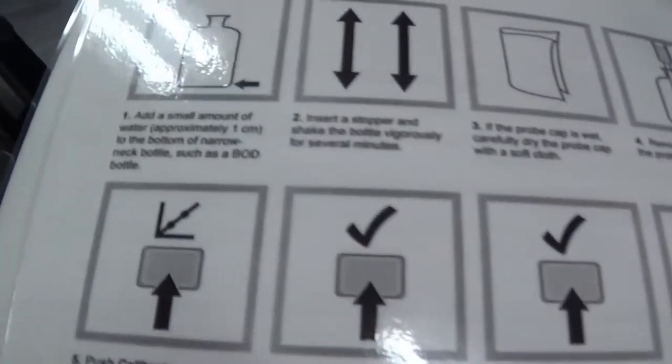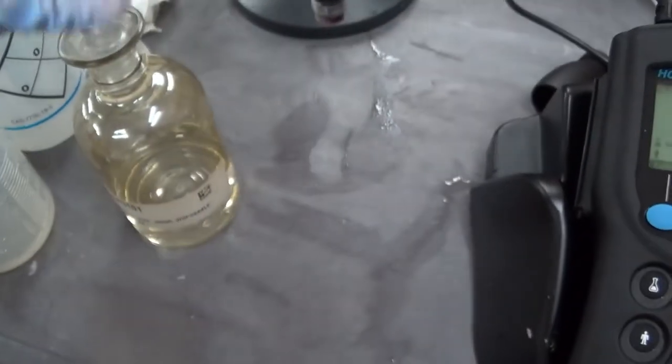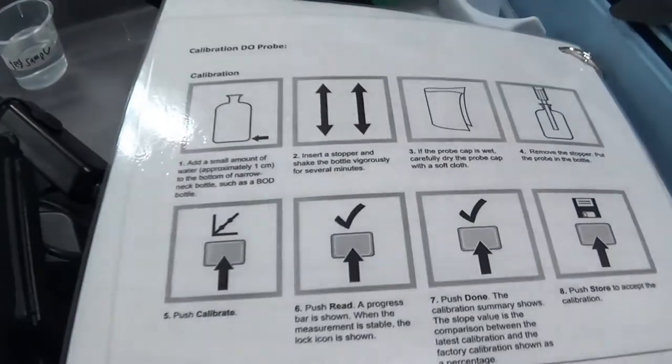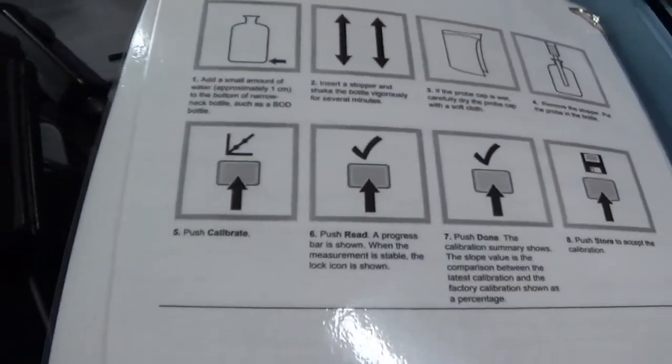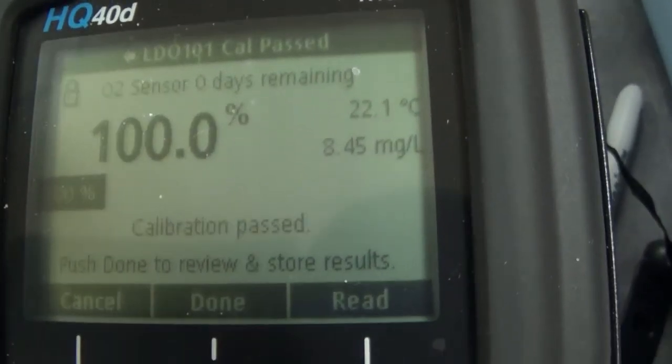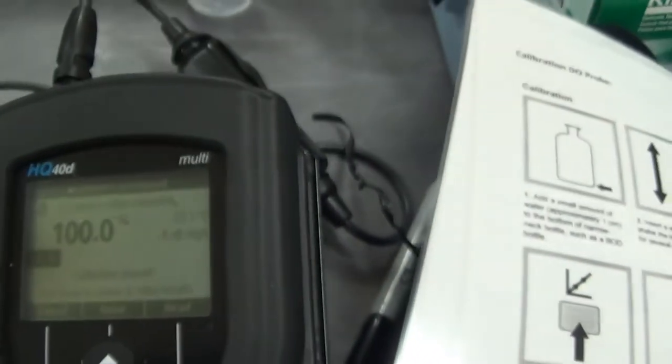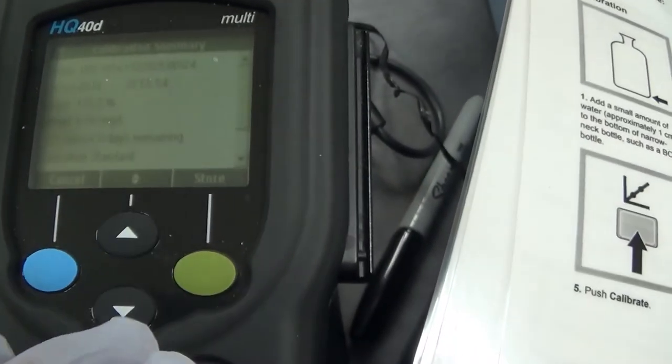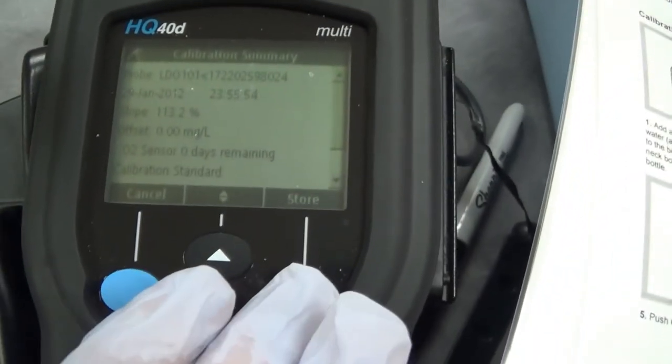Our directions are on the next page. We have our BOD bottle. We add a little bit of water to it. Then we are going to take the stopper, shake it for several minutes. I will do it for several minutes. Test stabilized. Calibration has passed. Push done to review and store results. Done. There is our results there. And store.